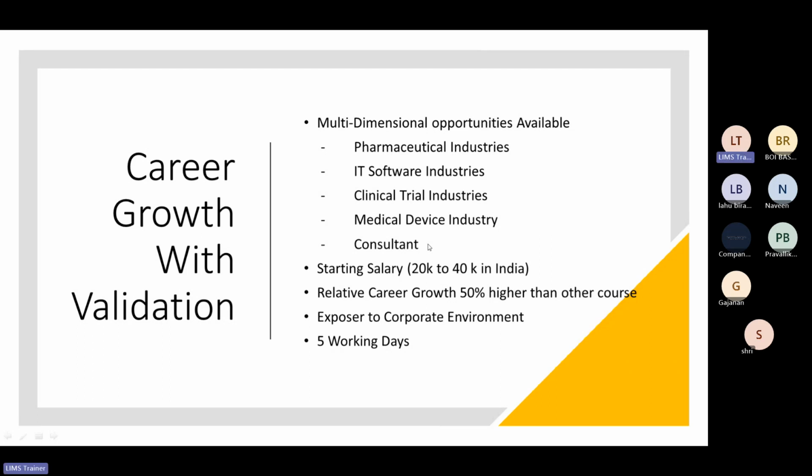Because what happens in the industry, it's not possible to work with all the modules, right? Suppose you are working with sample management, it's not possible for that user to work with stability management. If you are appointed to stability management, it's not possible for you to look into other modules. That's why here all the knowledge will be shared with you, and you can utilize that knowledge in your future.